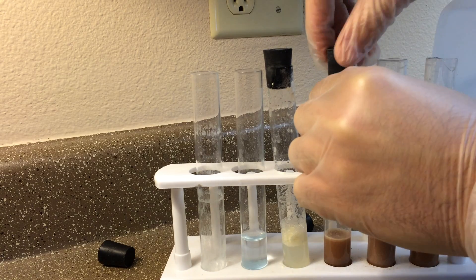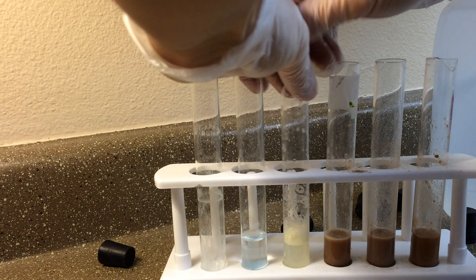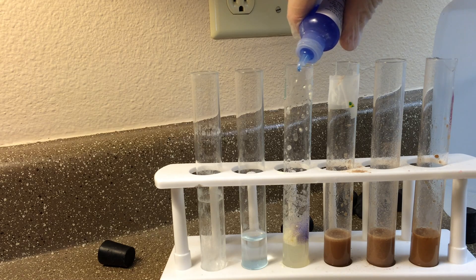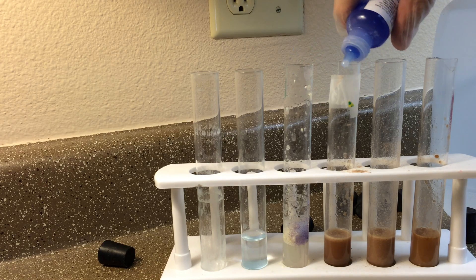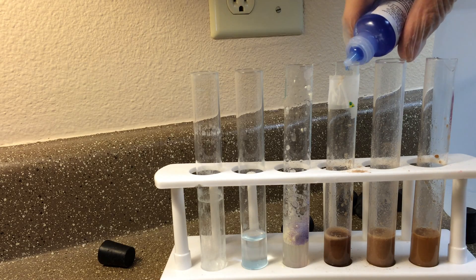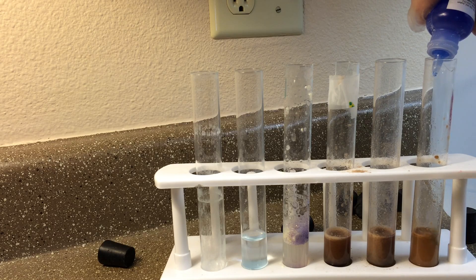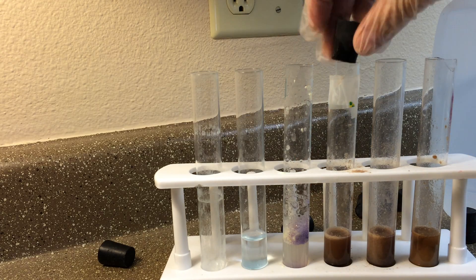Now we're gonna show you, in contrast to the distilled water blank, what it looks like with Biuret reagent added. One, two, three, four, five — you can see it turns dark purple when bound to protein. We'll go ahead and put six drops in every one of them.